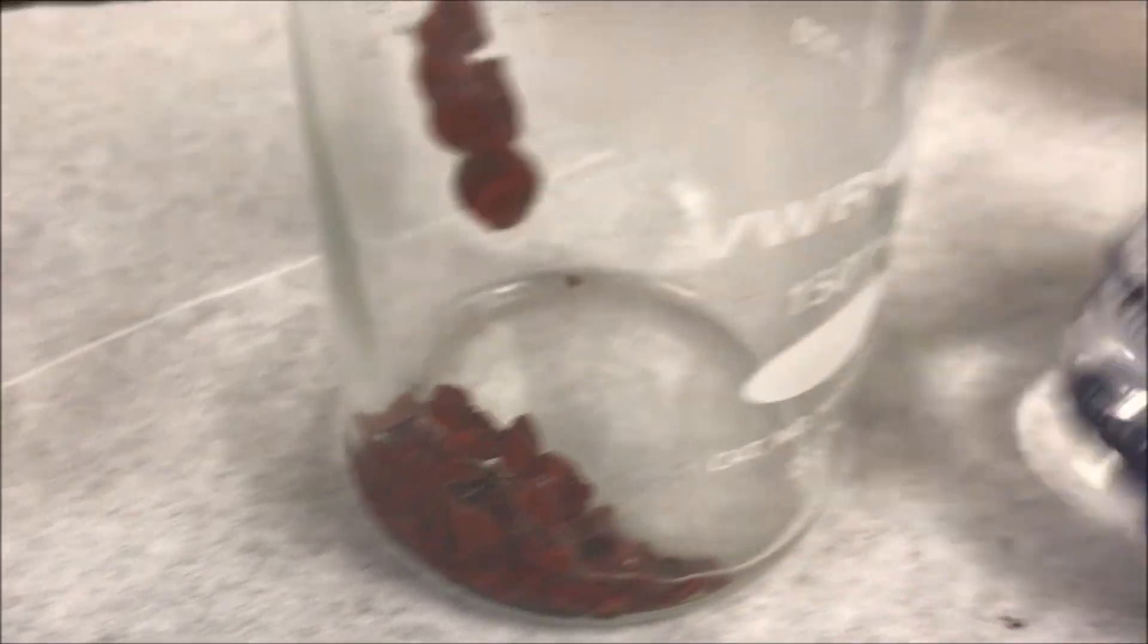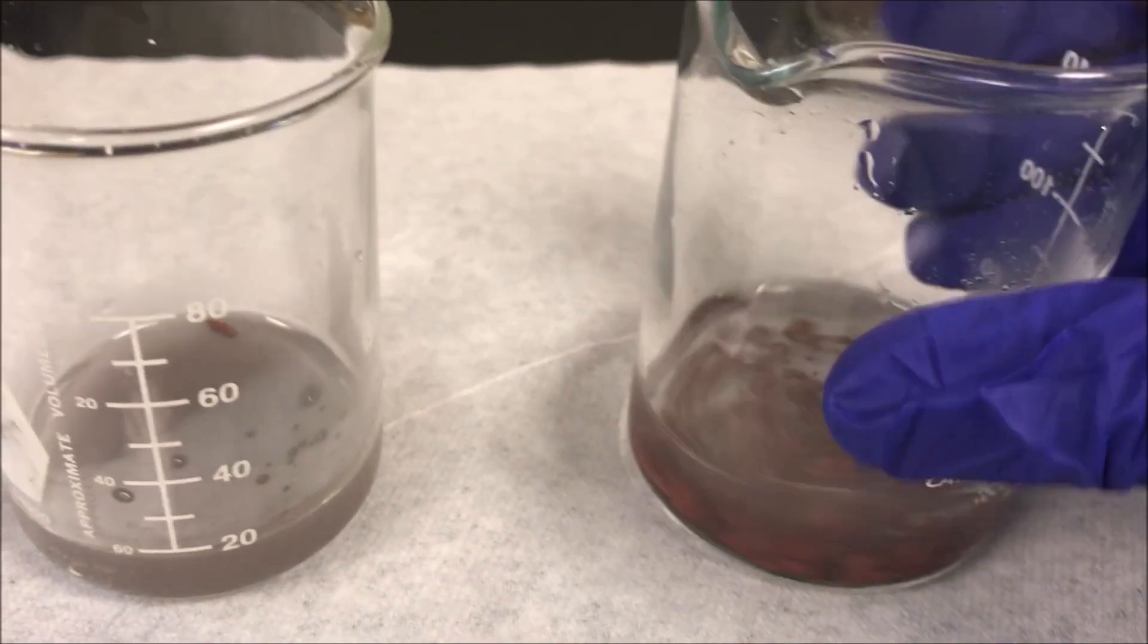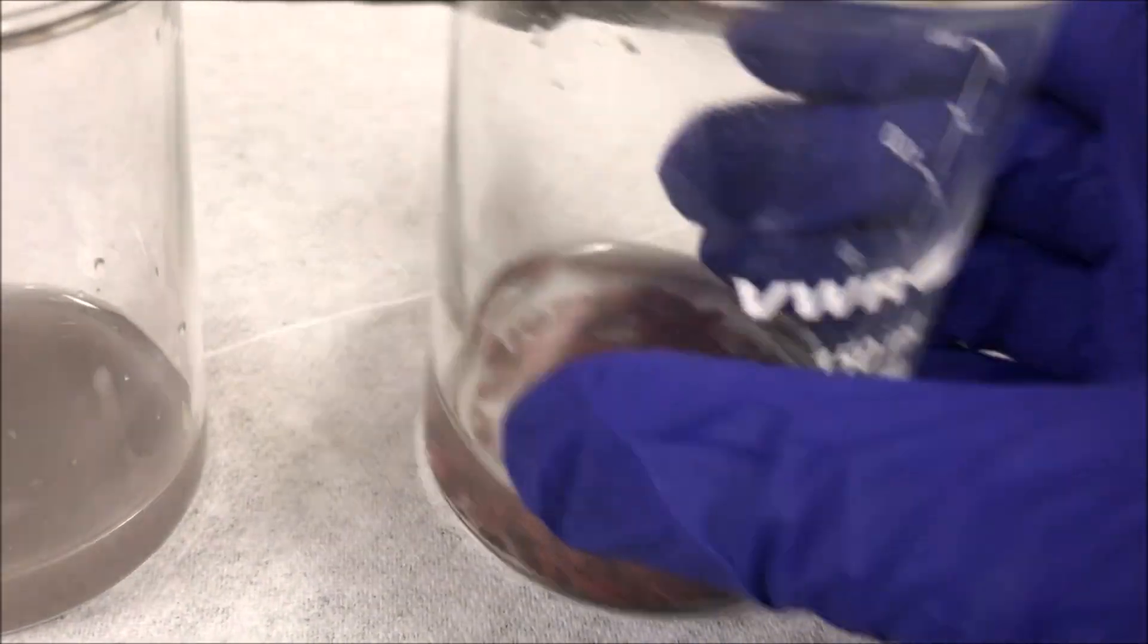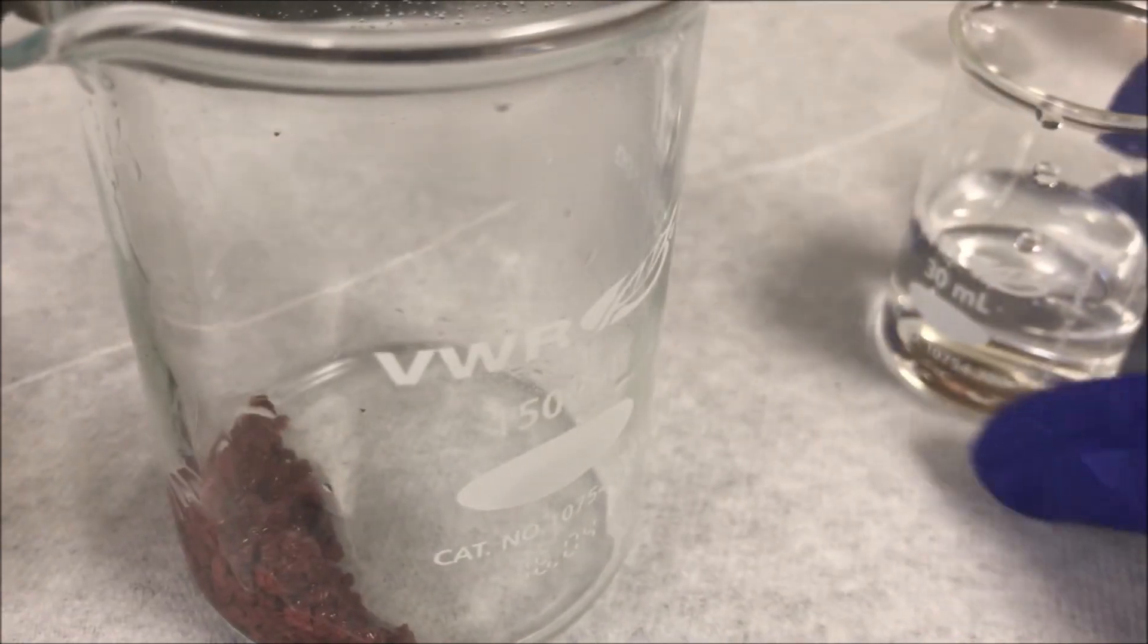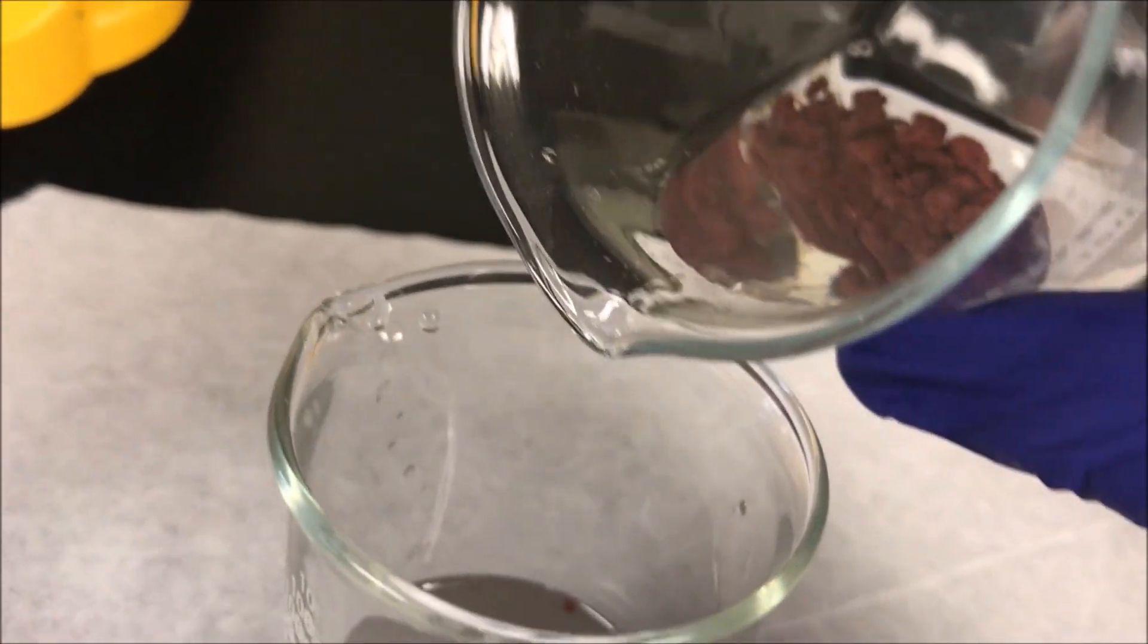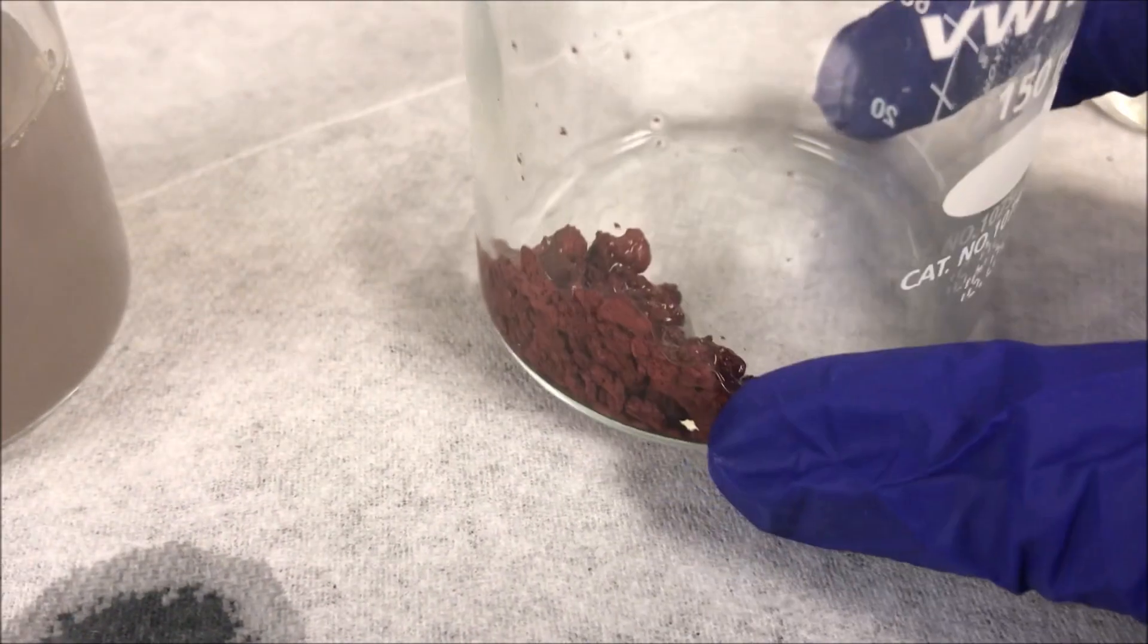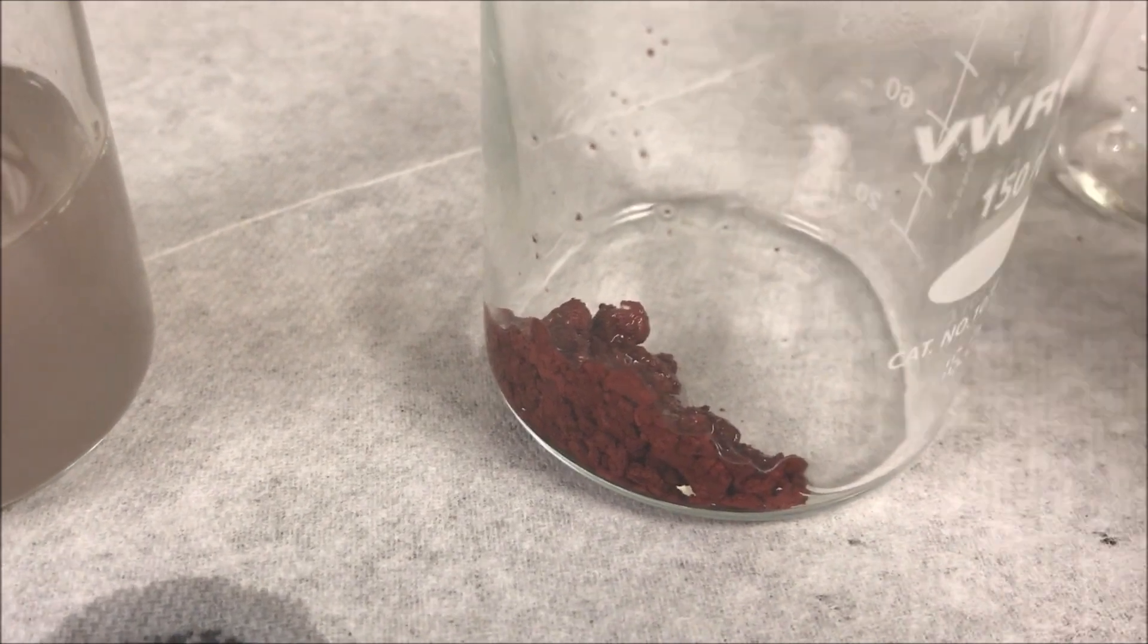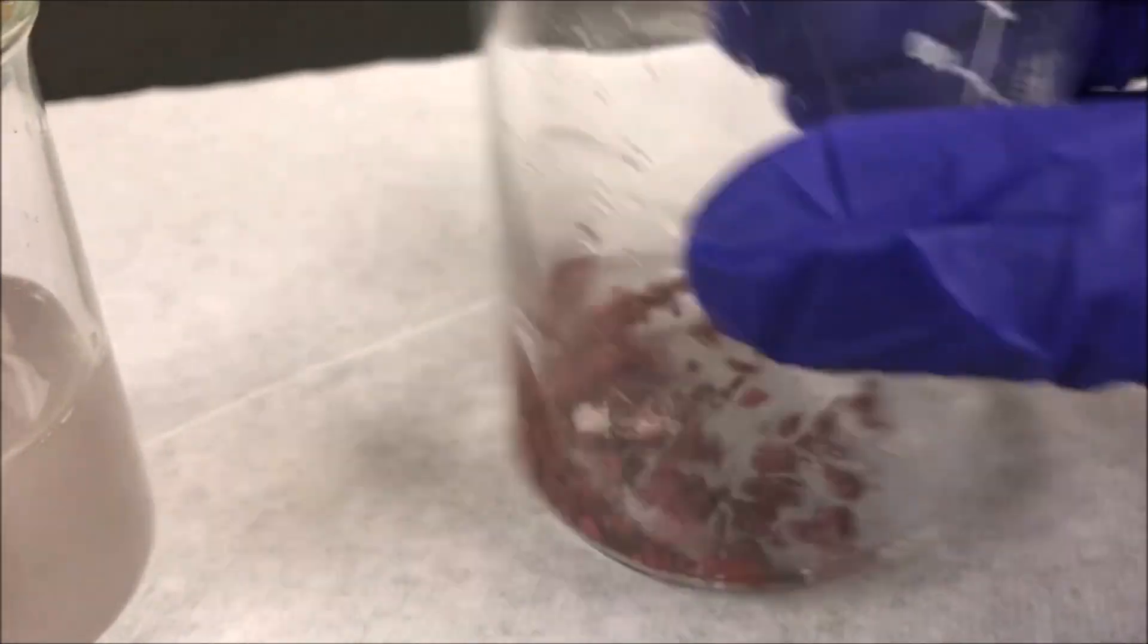Now rinse the copper product with deionized water. Wash the copper product with deionized water two times. Each time you can use 20 ml of water.